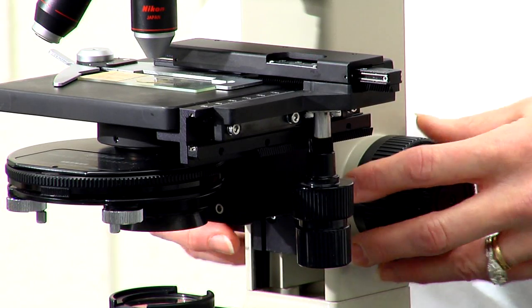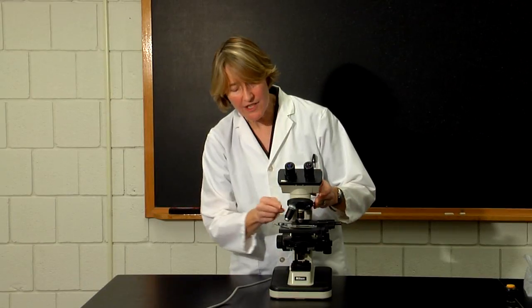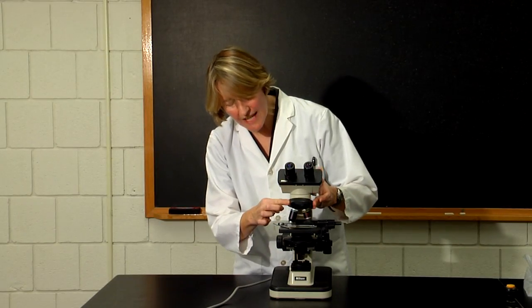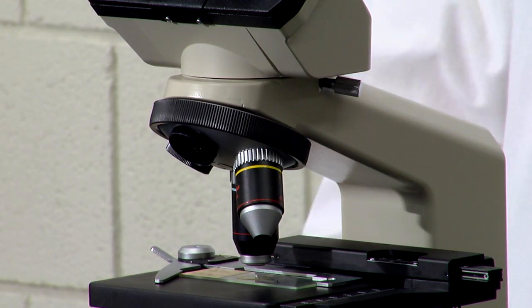The sample may not be completely in focus, but you should only need to make minor adjustments with the fine adjustment knob. Also notice that the higher power lens is longer, but once you have focused with the lower power lens, you should be able to rotate the higher power lens into position over your sample without any constraints.